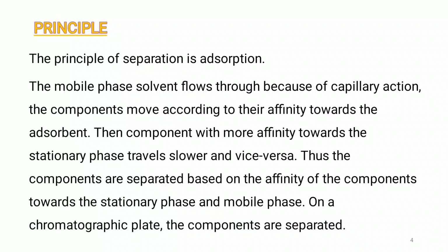The mobile phase solvent flows through because of capillary action. The components move according to their affinity towards the adsorbent. The component with more affinity towards the stationary phase traverses slower and vice versa. Thus, the components are separated based on their affinity towards the stationary phase and mobile phase.